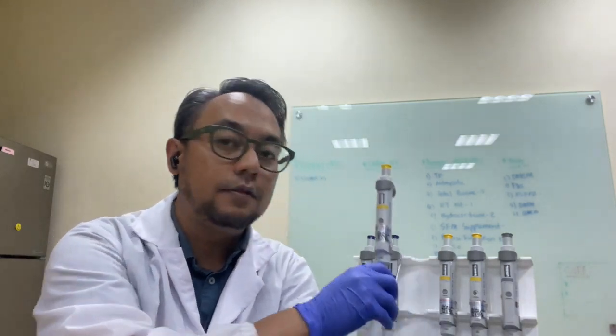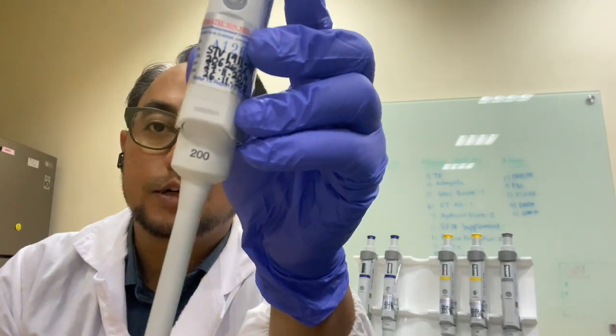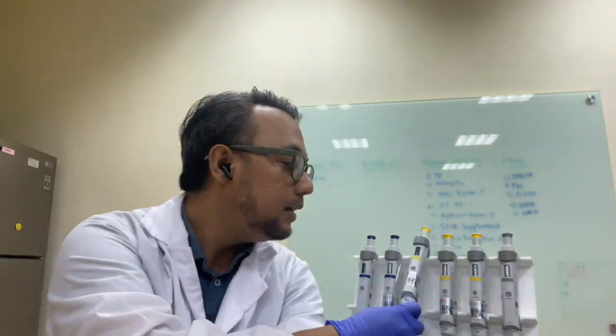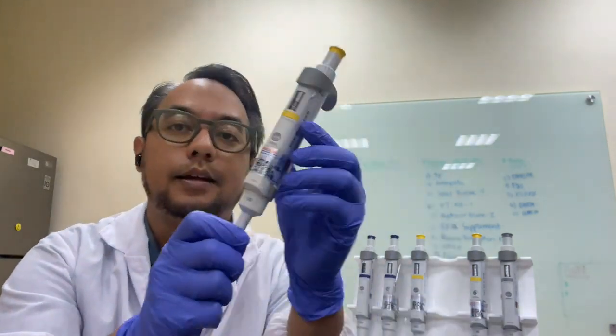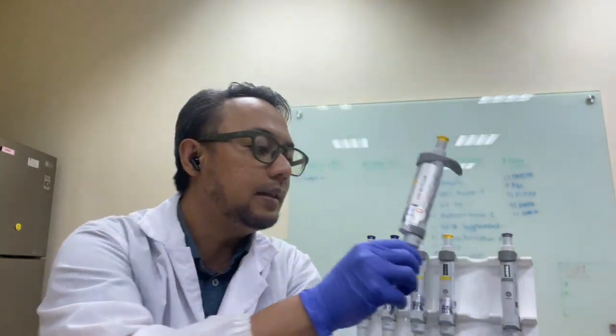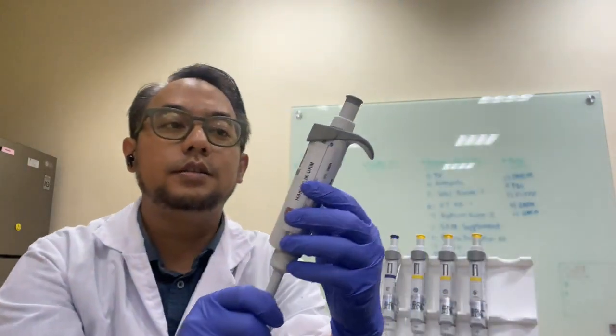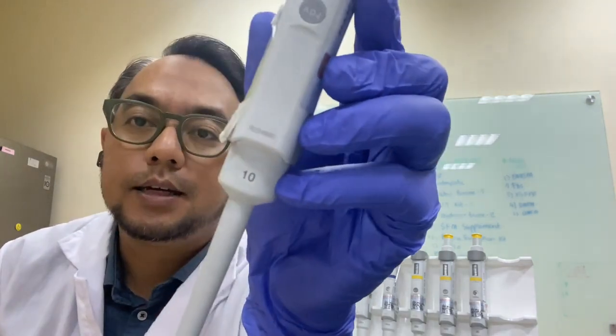And another volume of pipette is 200 or 200 microliter. And then 100 microliter. And 20 microliter. And the smallest one will be 10 microliter.